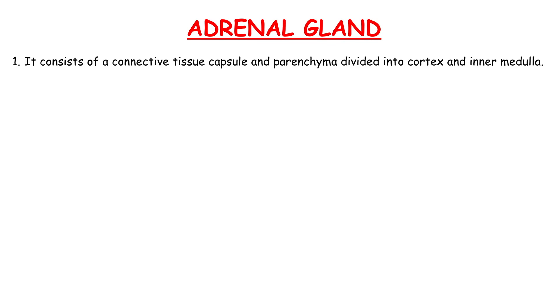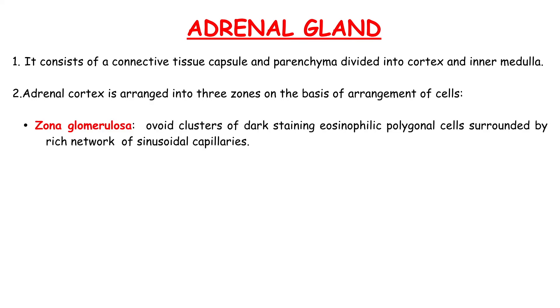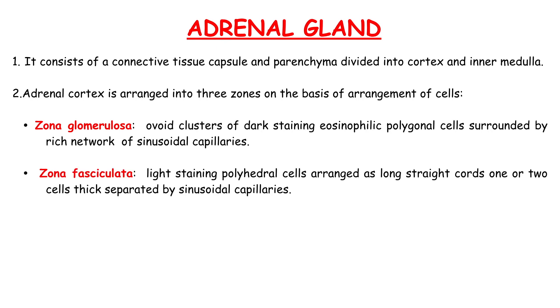Adrenal Gland. It consists of a connective tissue capsule and parenchyma divided into cortex and inner medulla. The adrenal cortex is arranged into three zones based on the arrangement of cells. Zona glomerulosa consists of clusters of dark staining eosinophilic polygonal cells surrounded by a rich network of sinusoidal capillaries. Zona fasciculata contains light staining polyhedral cells arranged as long straight cords, one or two cells thick, separated by sinusoidal capillaries.